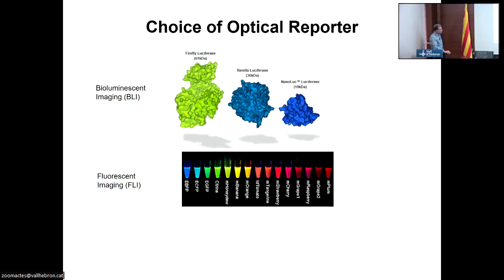Just to start off, as Guillaume already said, there are a range of different luciferases that we can use. The most popular by far is firefly luciferase. This requires ATP, so energetic, metabolically active cells produce light. But if you use Renilla or NanoLuc or Gaussia, then these are ATP-independent molecules, so they're nice complementary molecules to use. NanoLuc in particular is incredibly bright, even though it's blue, and doesn't require ATP, and it's become a very popular molecule to use.